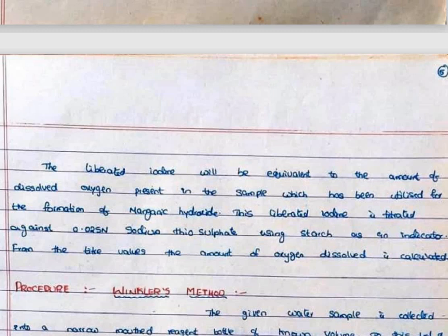So in the paragraph now, the liberated iodine will be equivalent to the amount of dissolved oxygen present in the sample, which has been utilized for the formation of manganic hydroxide.